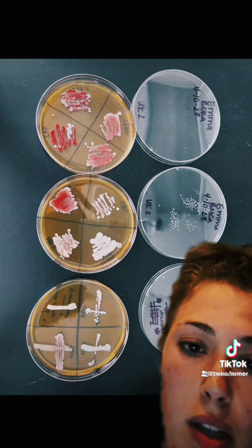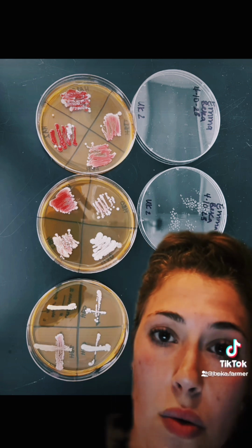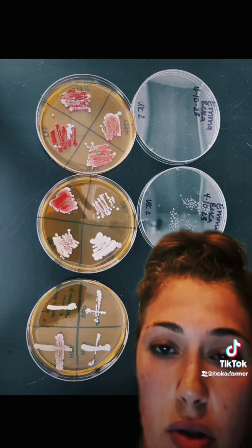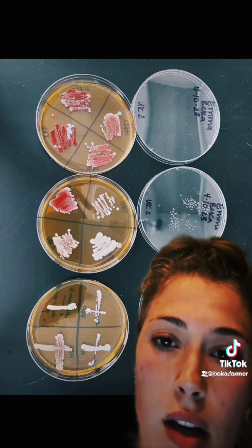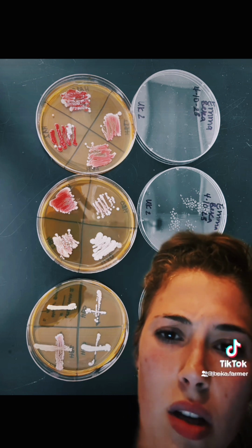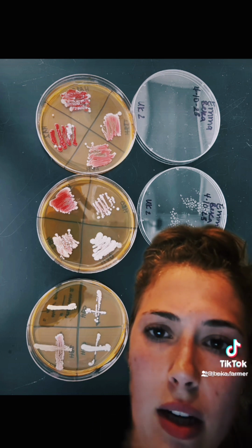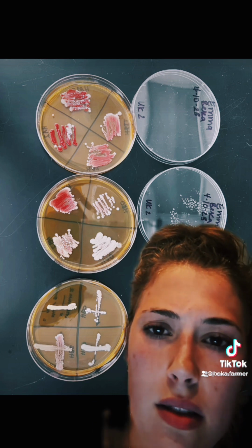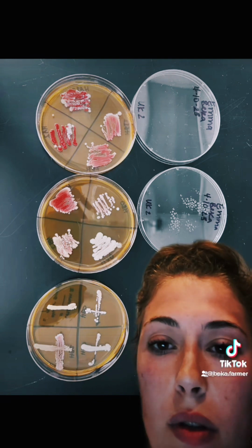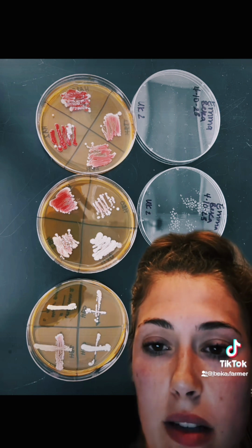So the first 2 plates were the original testing. We tested unknown 2 and tested the mutant and wild type strains. And then we got a little cross-contamination in the HB2, HBO regions. It's a little unclear as to if it was fully red or was rescued by the white cells.